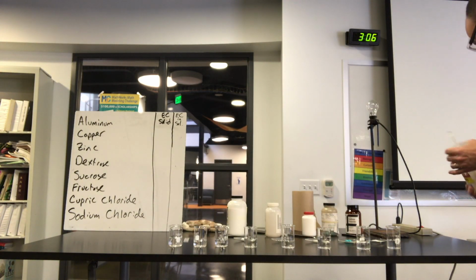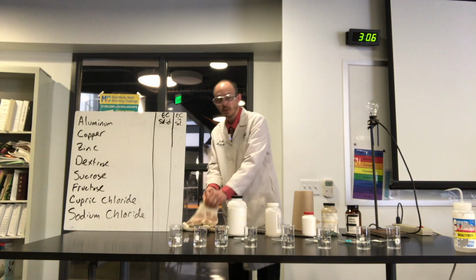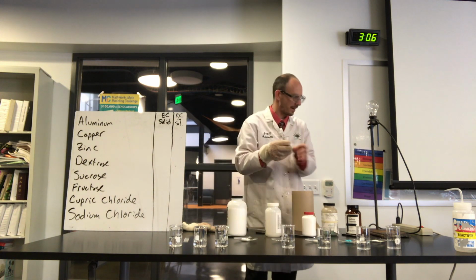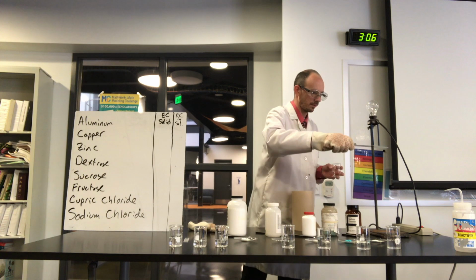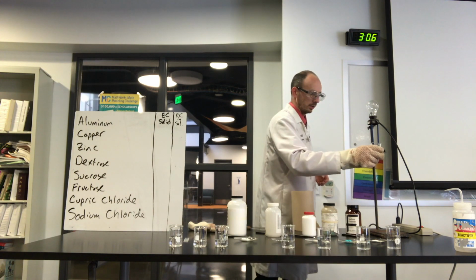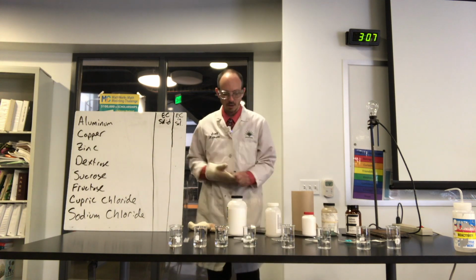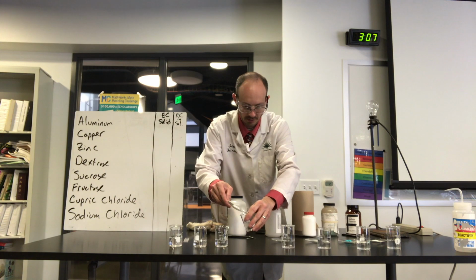And to show you no trickery, I'm going to take any of them. I'll just take this one. There's nothing in it yet. That's still active, still on. Okay. And this is just the water from there in here. Nothing.